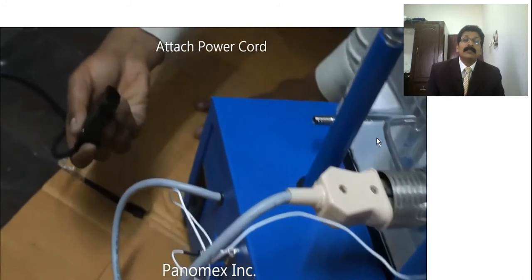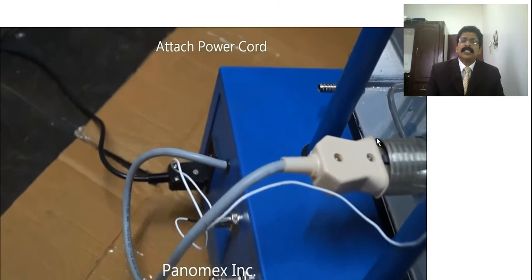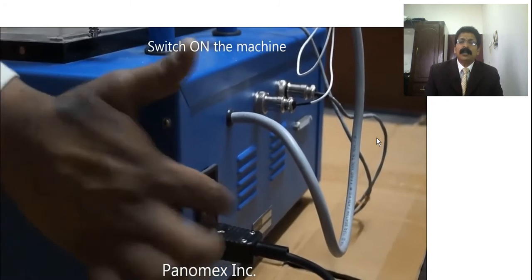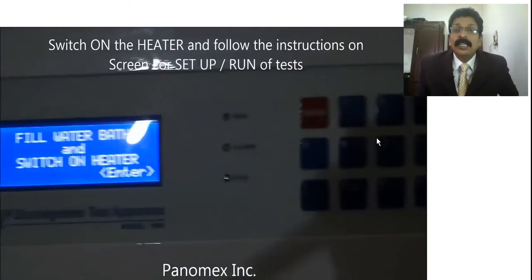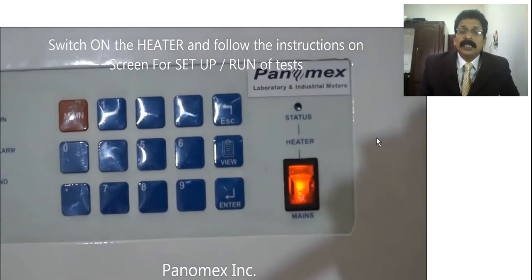Another is for the digital action, and other machinery power plugs are also fixed. When you put the switch on, after filling the water, you will get the screen, that is heater, switch on the heater. You have to maintain up to 37 degrees centigrade.